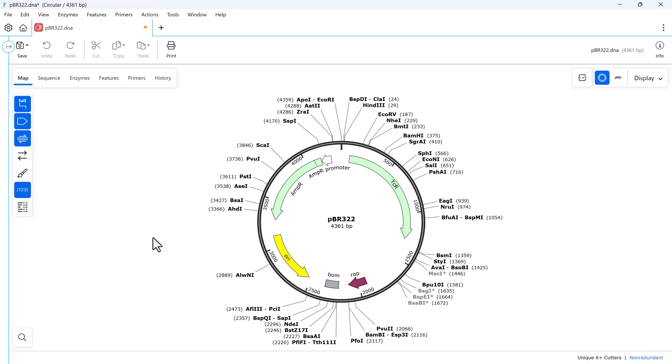By default, SnapGene displays restriction enzyme sites that appear once in your sequence and have a six or more base pair recognition site.